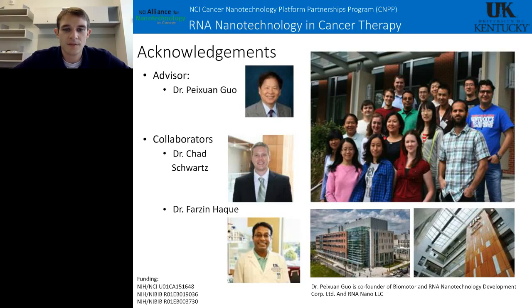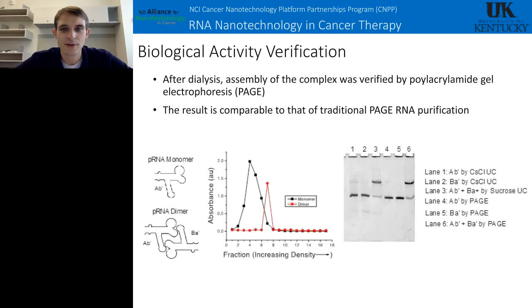I would say the purity of the RNA is pretty high. If you look at the slide here, I don't know if you can still see it, but the two bands in lanes 1 and 2 compared to 4 and 5 by traditional PAGE are very, very similar. So I would say if you think PAGE purity is good enough, then I would definitely think that ultracentrifugation purity is good enough. And as far as cesium chloride in vivo, I can't say for certain, but I assume that it would not do good things in vivo. So there could be some side effects.